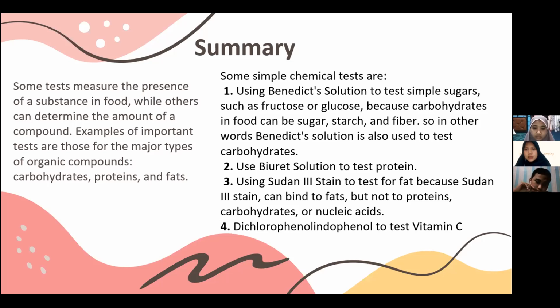Test 3 is using Sudan III stain to test for fat, because Sudan III stain can bind to fat but not to proteins, carbohydrates, or nucleic acids. Test 4 is using dichlorophenolindophenol to test for vitamin C.